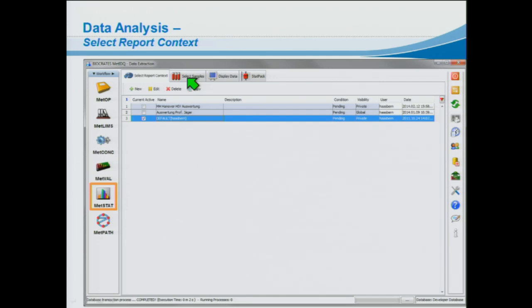Actually, this is what we want to do. Have you used this feature? It's the report. Apparently not. Maybe I should talk offline about the program. I think he's asking whether you can store every job that you've done, so that in the future you don't have to go back to it. Yes, that's what this feature is. It records it.